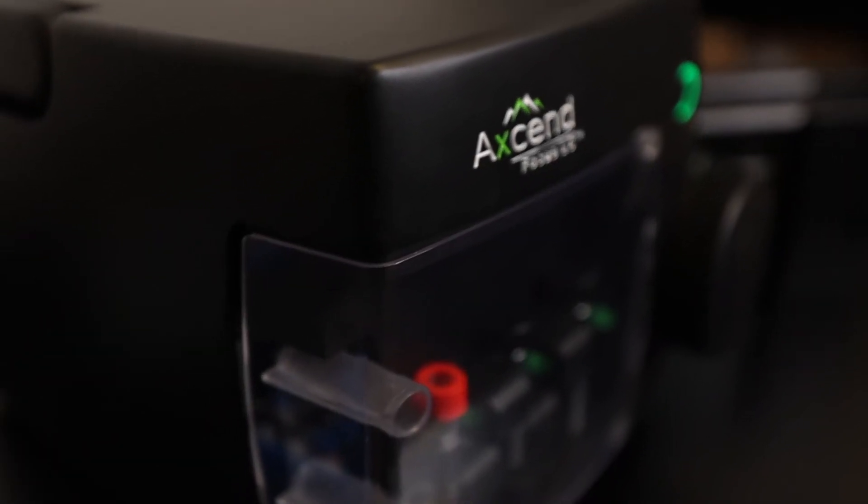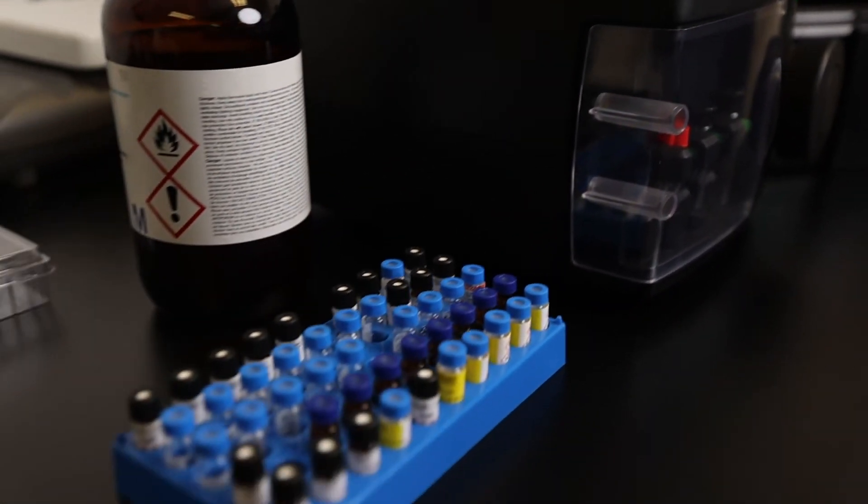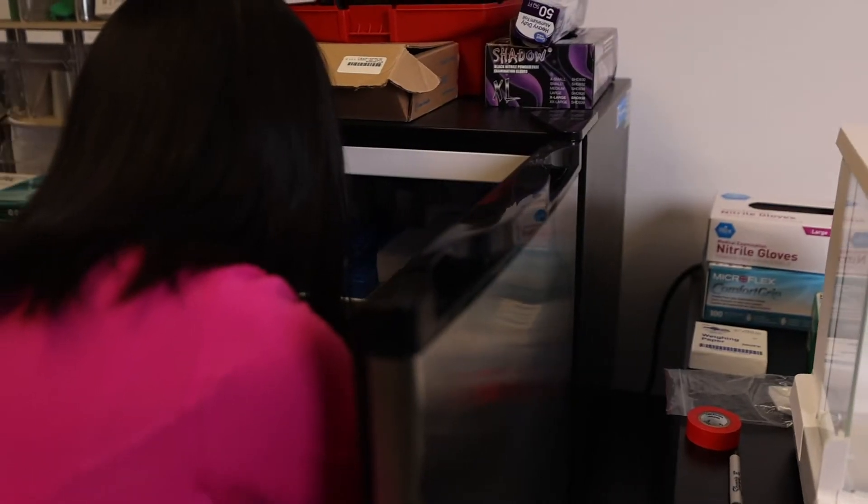The XenFocus LC is a two-pump binary gradient system capable of operating pressures over 10,000 psi, running anywhere from one-half to 10 microliters per minute depending on the column and use.